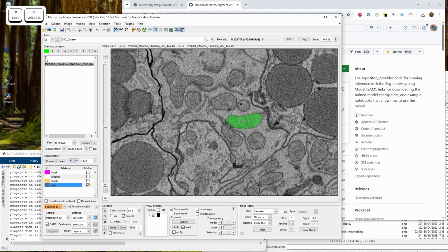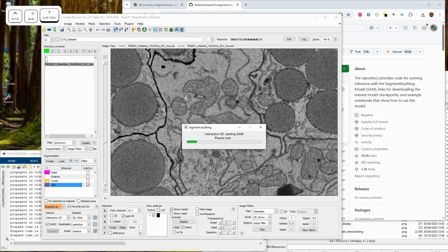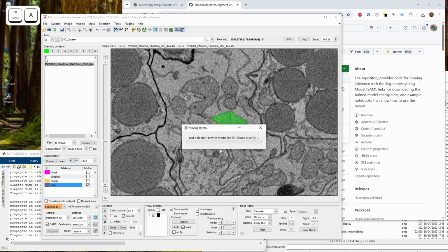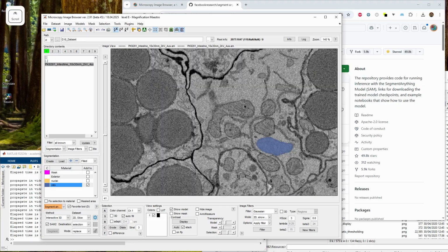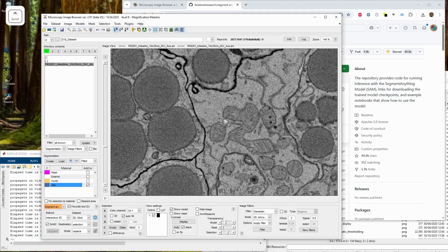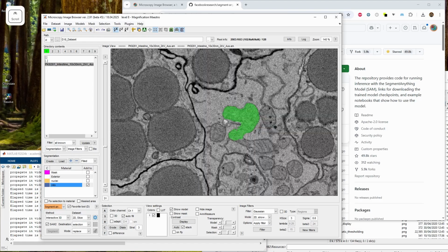Let's say I go here and then I scroll the other way, maybe until the moment when they get merged with the other one, and then I press Shift A, and then I can do this one, Control click here. Not sure. Okay, maybe that was the correct selection. Oh, this is quite a complex shape. I would actually keep things as simpler shapes, because otherwise it gets really confused. Usually you combine things from multiple.